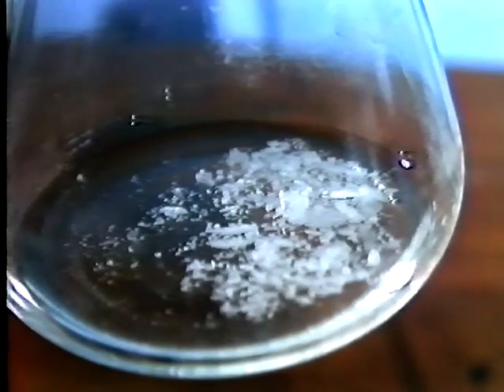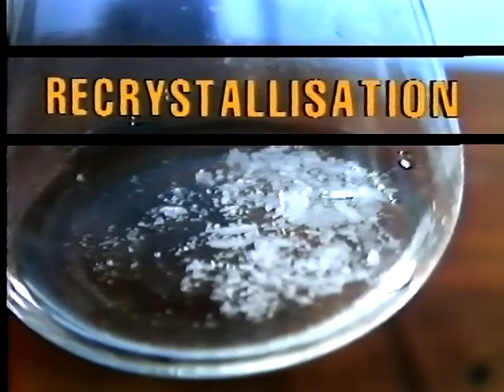Because of the variation in amount and purity of samples which you may have to recrystallize, you will have to adapt these basic techniques throughout your chemistry course to the particular need that you will find. And to master all aspects of recrystallization, you will require plenty of practice.